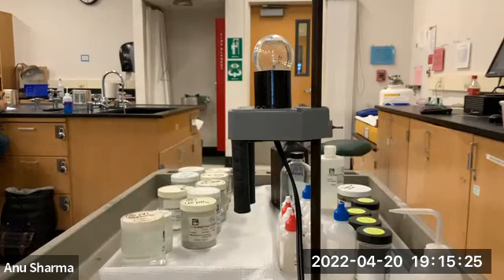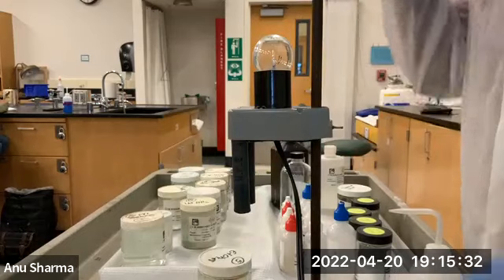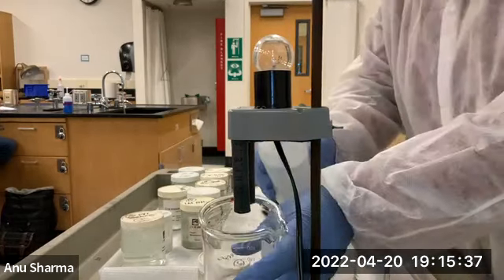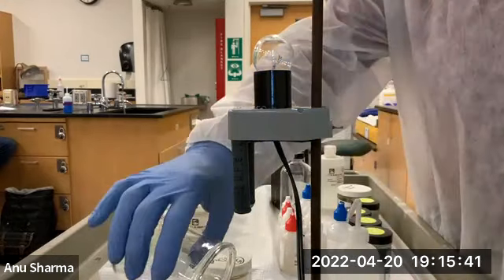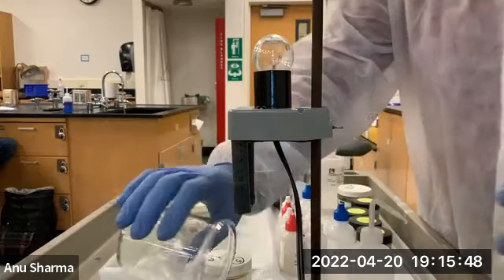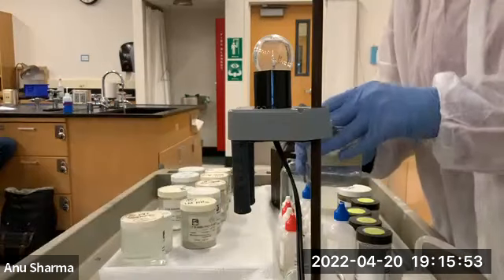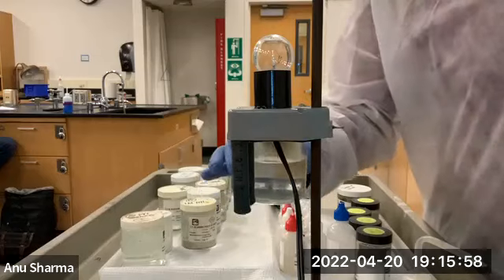Next is the same ethyl alcohol mixed in water. You take this ethyl alcohol, C2H5OH, and dissolve it in water. What do you guys think? Will it make ions? Yes. Okay, so one is the hydrogen bonds. So here is this ethanol.